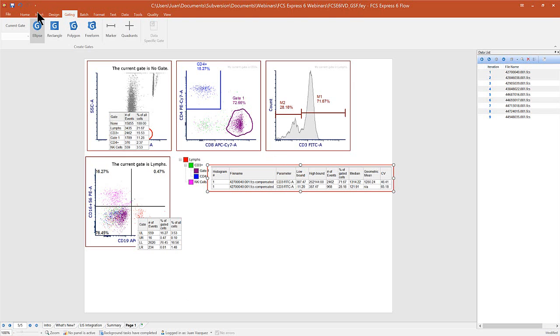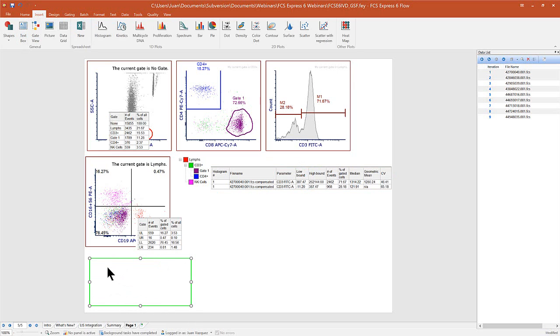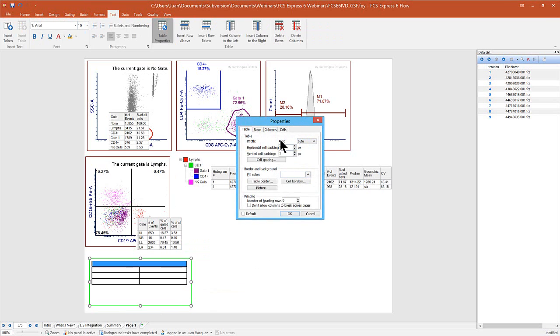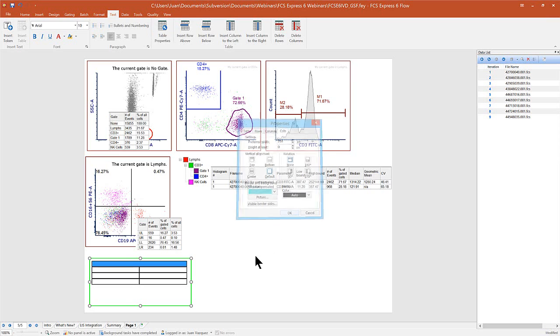Okay. So the first thing we can do is simply insert a text box, and within this text box we can create a table, just like you would create a table in Word, PowerPoint, Office, Excel, whatever. We simply designate how many rows and columns that table is going to have. This table can be formatted like other tables, where maybe we want to merge. We have a full text editor, where maybe we want to provide some type of shading or fill color for that cell.